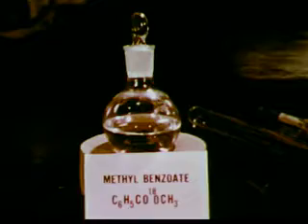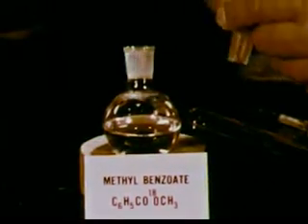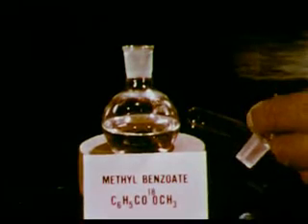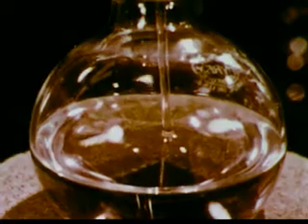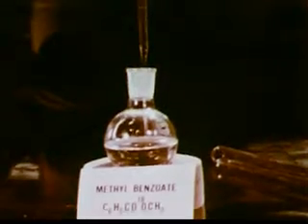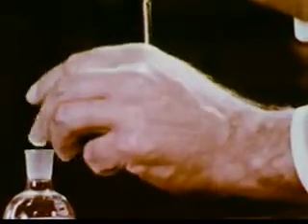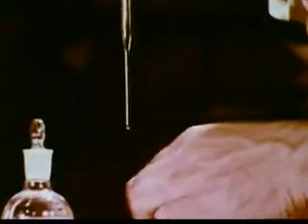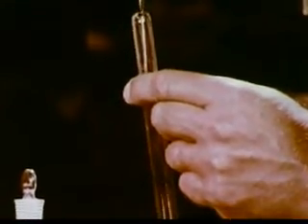Now let's check the presumably labeled ester. We do not place the ester directly into the mass spectrometer, since the large ester molecule would break into many smaller fragments difficult to identify. Instead, we withdraw a small sample of the ester with a pipette. We then introduce the ester into a quartz tube. As you see, only a drop or two is used.